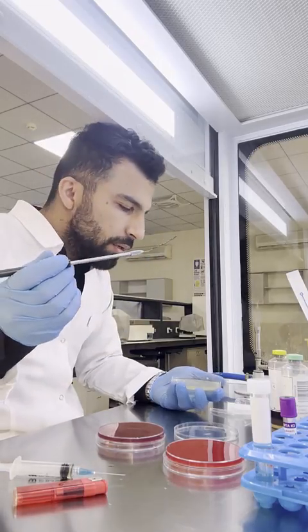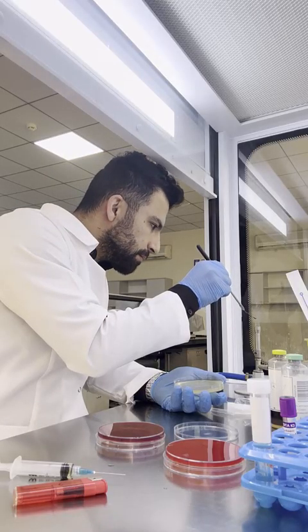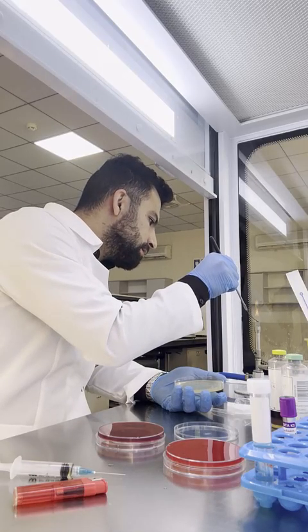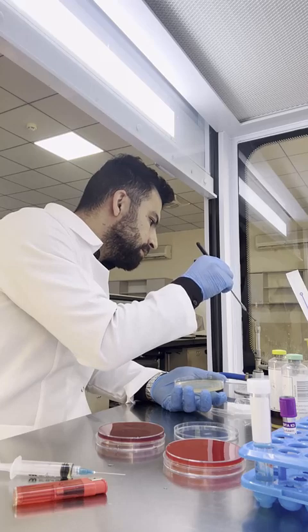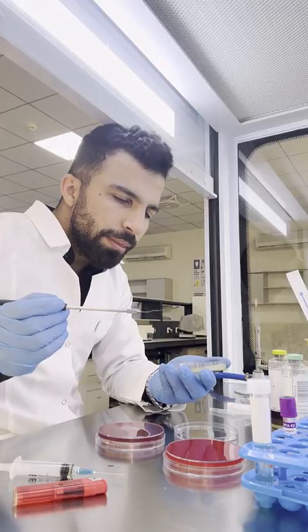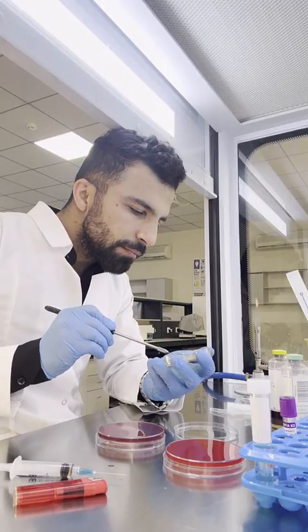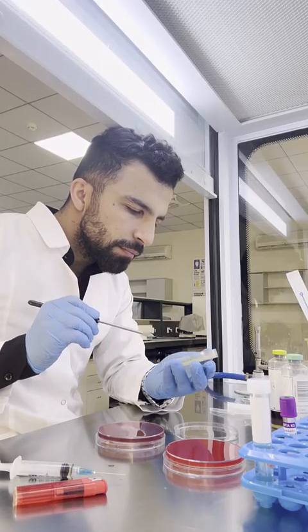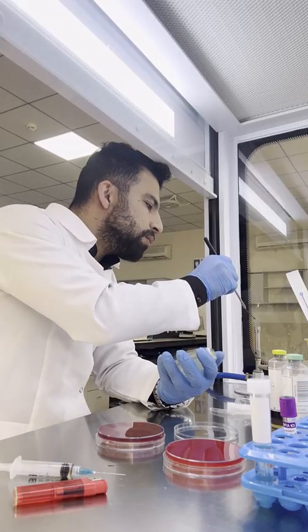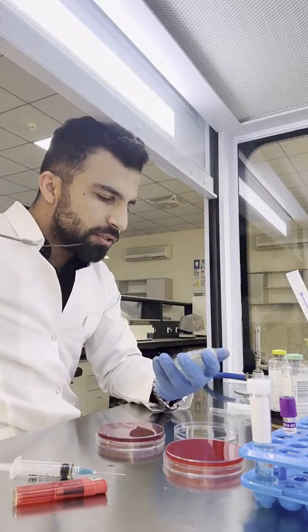First, we are going to sterilize the loop. When we sterilize the loop, we are going to cool it down. And again, for each step we are going to sterilize the inoculating loop and let it dry.